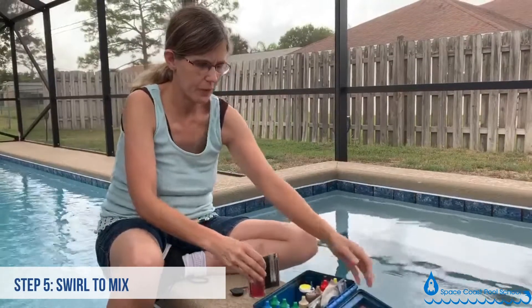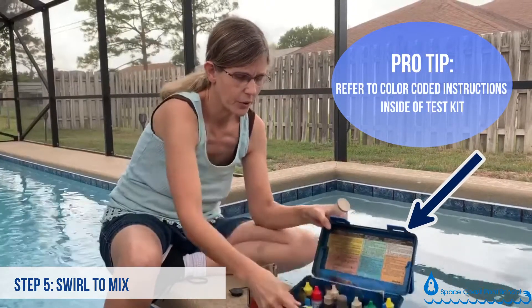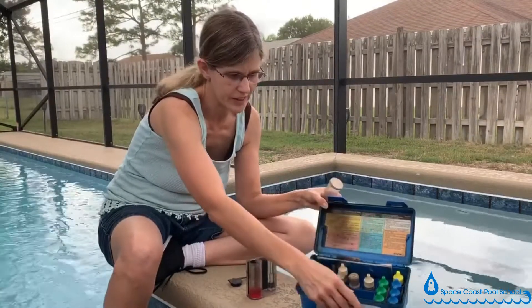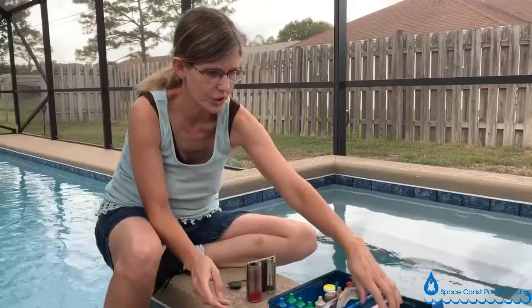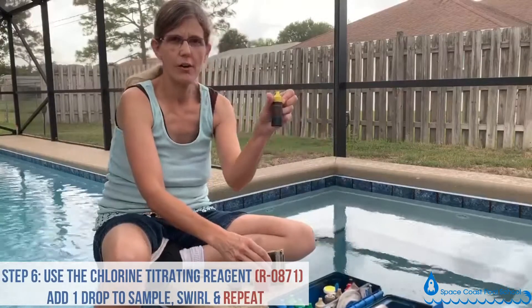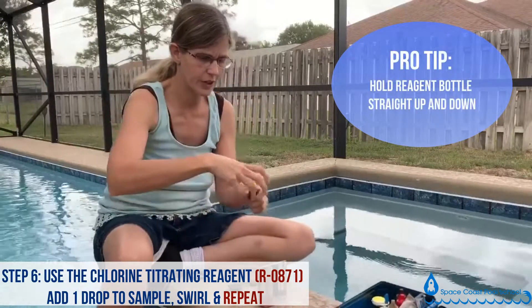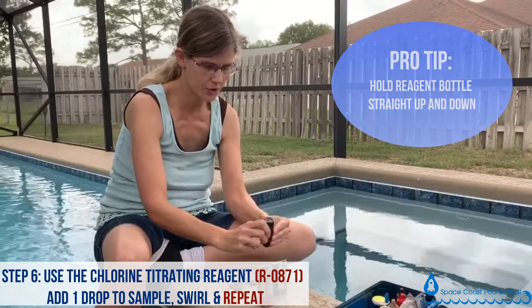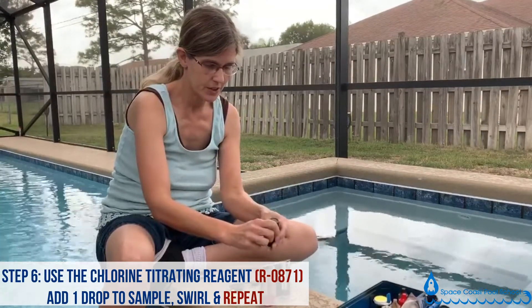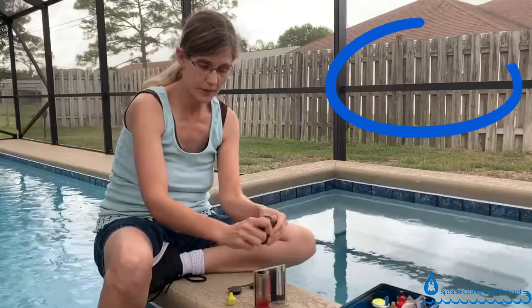I want to point out that there are instructions in the lid, which are color-coded with the different test reagents listed for each test — you can refer to those if needed. After mixing, take your R0871 titrating reagent for chlorine and add drops one at a time, holding your bottle straight up and down — that is very important. Swirl to mix between drops and count as you add this reagent until it goes from pink to colorless.